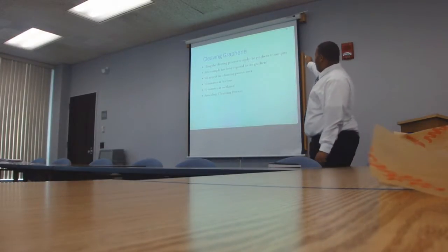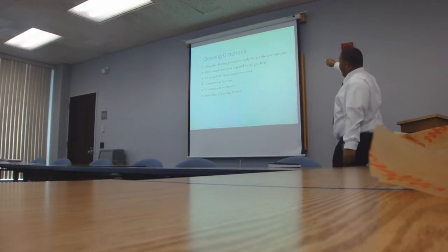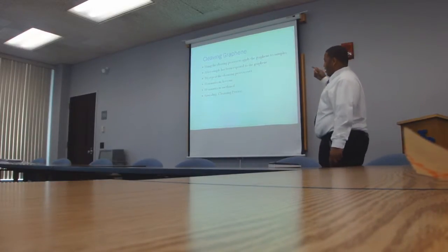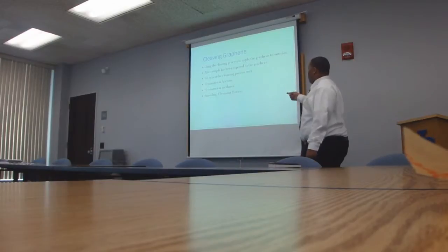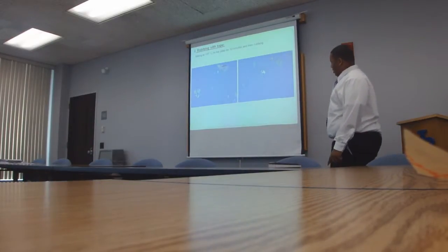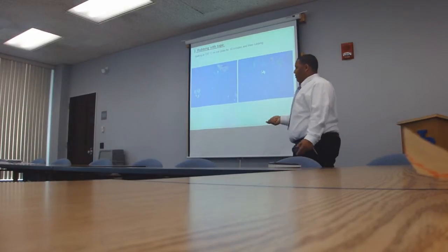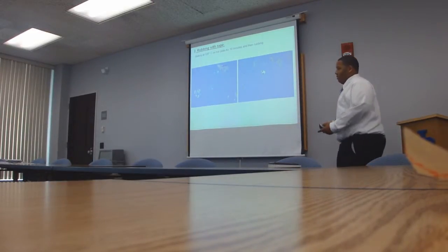2. Basically, this is the process to apply graphene to samples. After samples have been exposed to the graphene, we repeat the cleansing process, again 10 minutes in acetone and 10 minutes in methanol. Then rubbing with the tape. That's the exfoliation process, also known as the Scotch tape method.